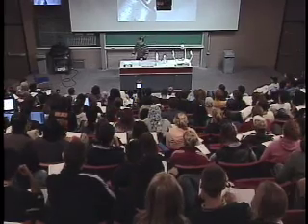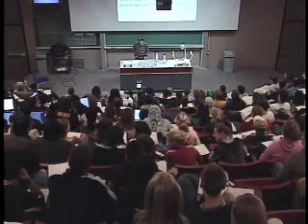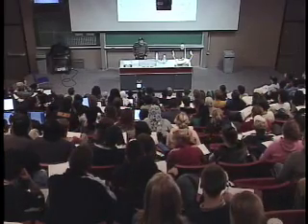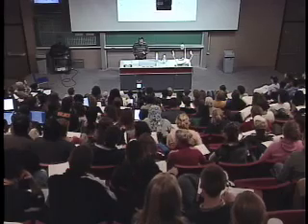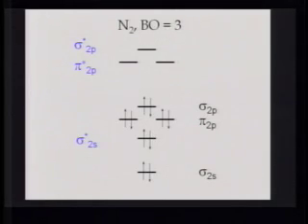Let's look at the MO diagram of nitrogen. There's nitrogen — no unpaired electrons. So I would predict that this stuff is not paramagnetic. Let's see if it's true. It should not stick to the poles of a magnet. I'll simply pour this into the magnet.